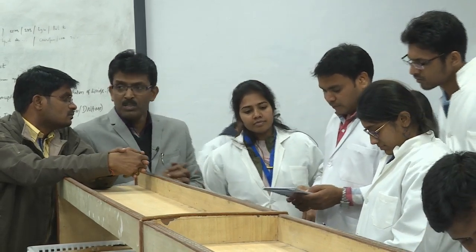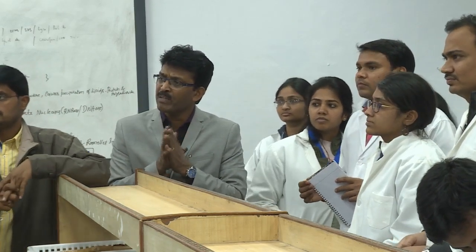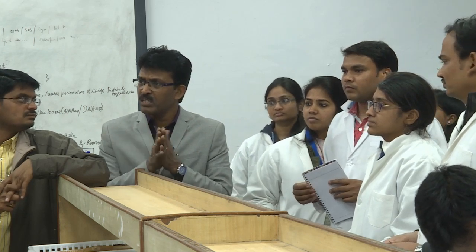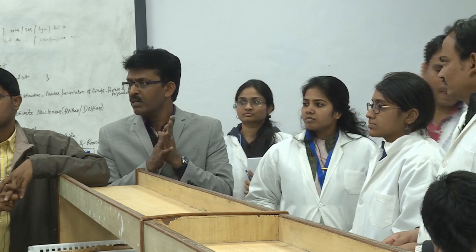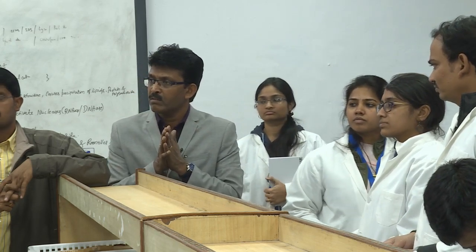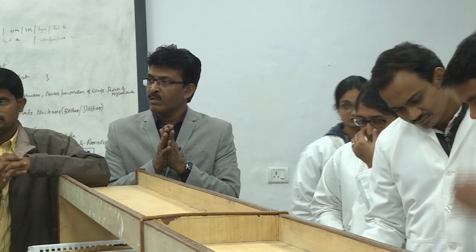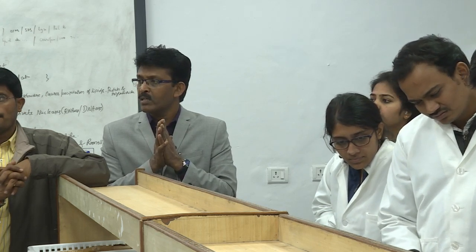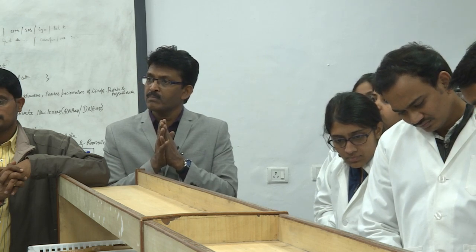Okay. Pseudomonas, Ralstonia, Kuleshwar, for Ralstonia which primer? All 16S only. Only Magnaporthe is a housekeeping gene. Protocol? It works, great. Chemistry is same, but reaction condition may be different.